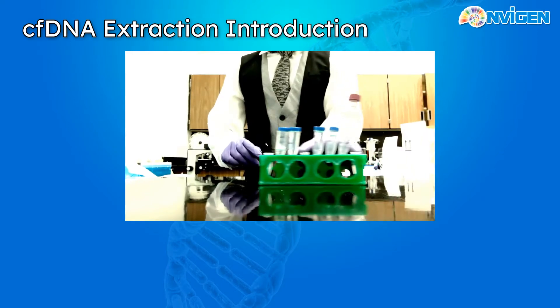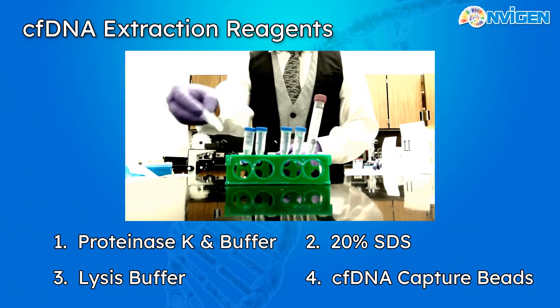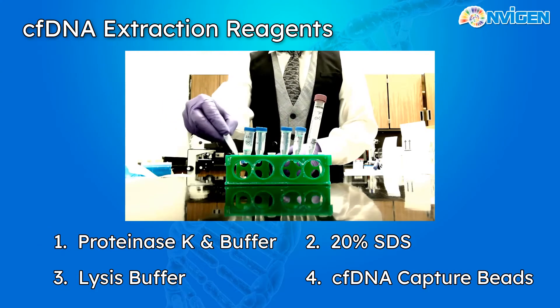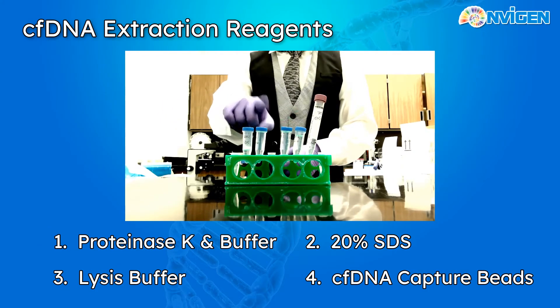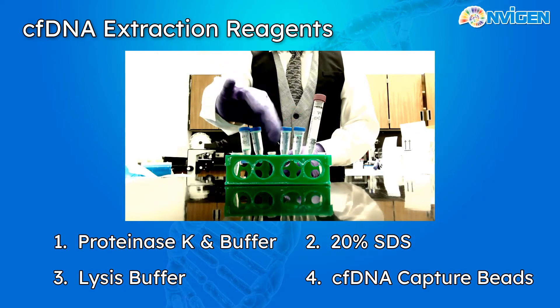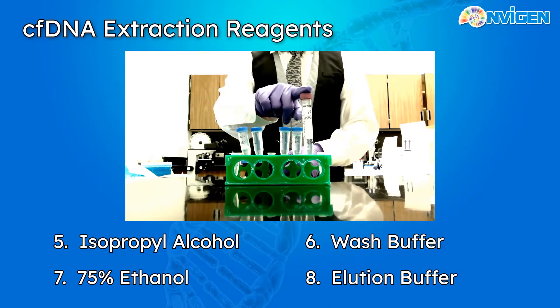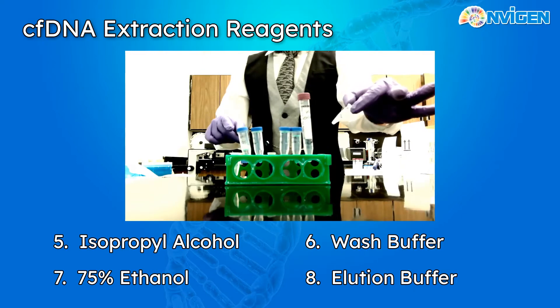Let's get acquainted with our reagents. First is our Proteinase-K and our Proteinase-K buffer, 20% SDS, lysis buffer, paramagnetic CFDNA capture beads, 100% IPA, wash buffer, our 75% ethanol, and finally our elution buffer.